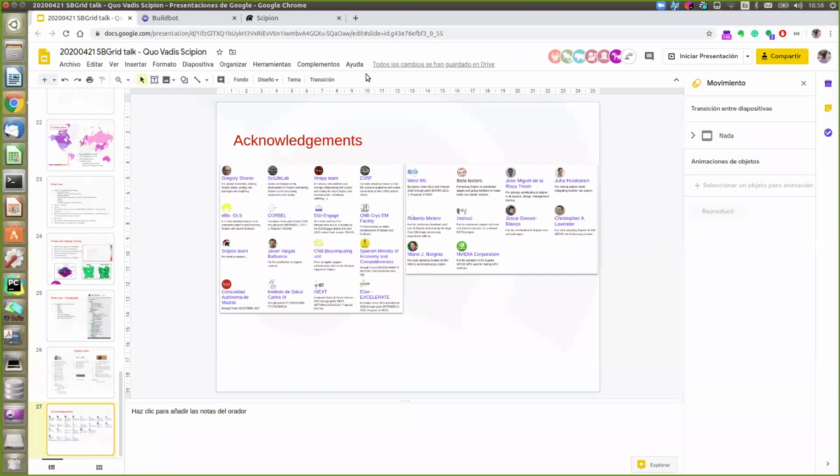A few more questions relating to Scipion 3 releases. Broadly, when do you expect the release version to be stable? And also related to that, how best for people to get hold of the newest upcoming release? I think it depends if you are among the pioneers, the brave ones. I think soon you will have something. Probably we will not announce it, but you can contact us and we can give you the instructions to install Scipion in beta testing mode.